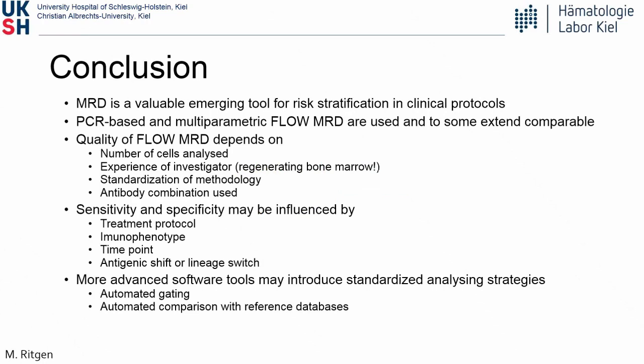It's always a question whether you like the combination as it is in the Euroflow panel together with CD66c. I think you have to get used to it, or whether you use it in a single stain. And I think it's comparable to CD66c, that most of the cases have a combined expression. More or less it's comparable, and you can take either one.